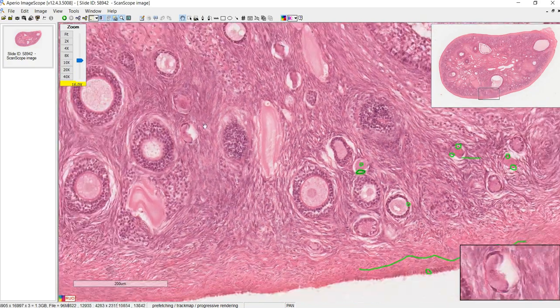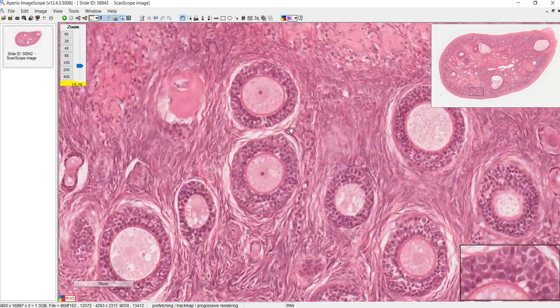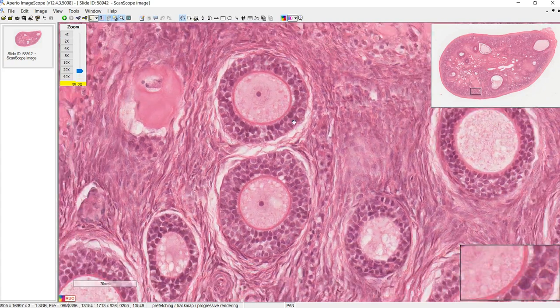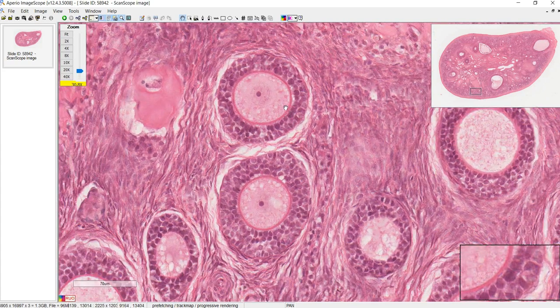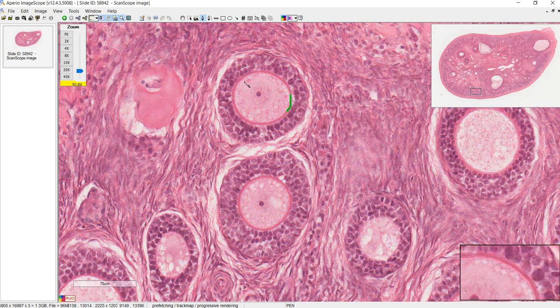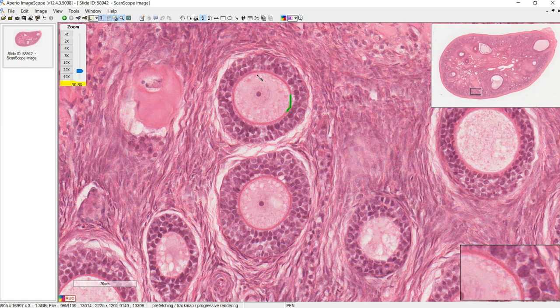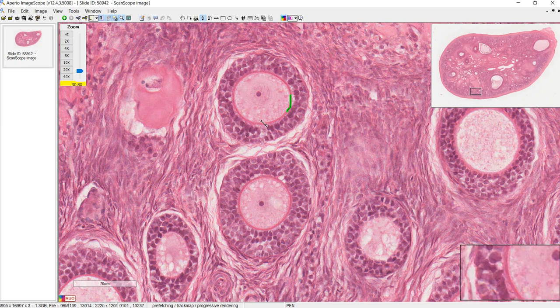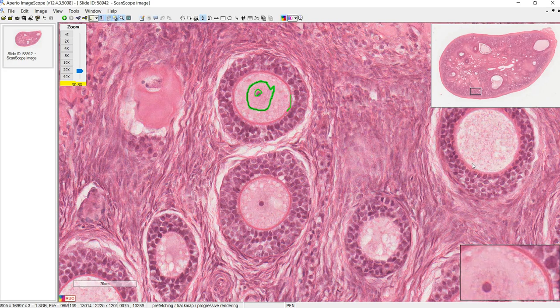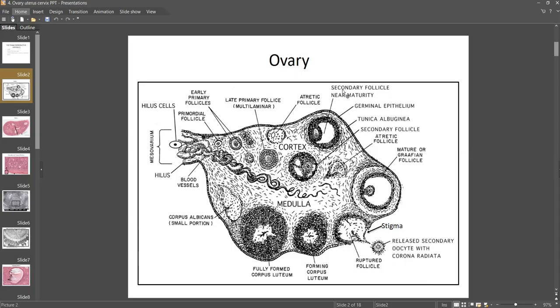These are nice examples of late primary follicles because there are multiple layers of granulosa cells. You can see the zona pellucida — this dark pink line that surrounds the oocyte. This whole area here is the oocyte; here's the nucleolus, and this is the nucleus of the oocyte.